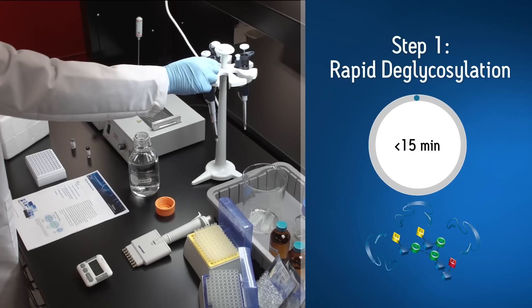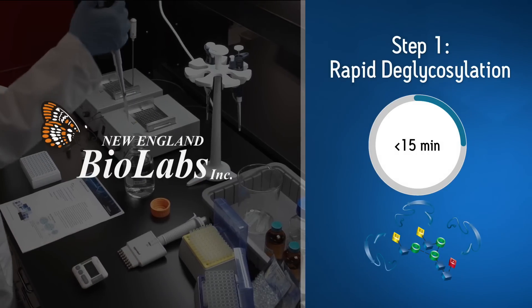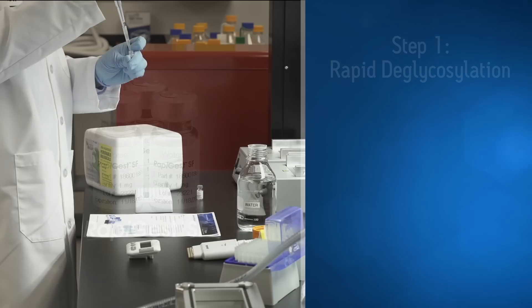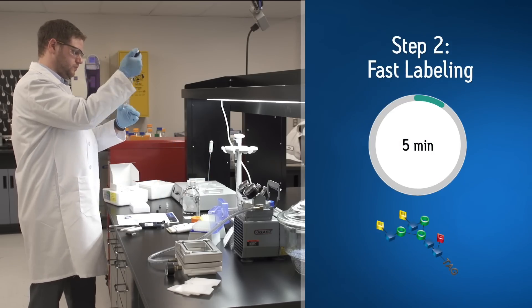It all begins with fast deglycosylation. Waters has partnered with New England BioLabs to offer rapid PNGase F with a customized buffer complemented with Waters RapiGest SF surfactant. Following rapid deglycosylation is instant labeling with RapiFluor-MS.